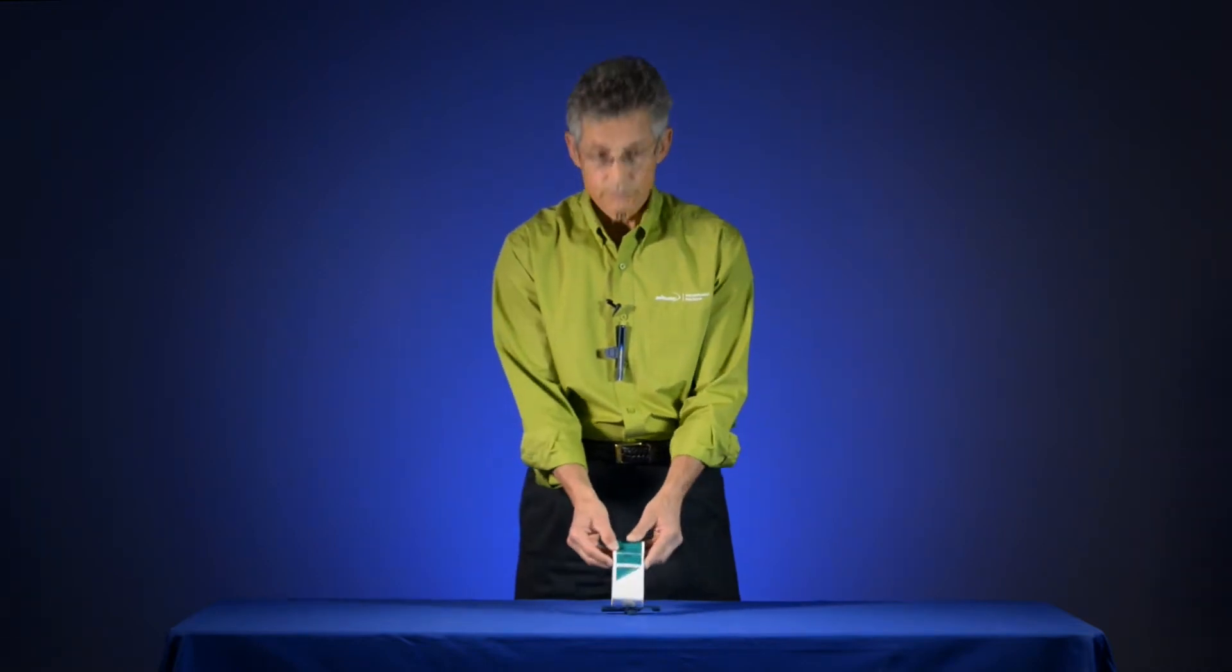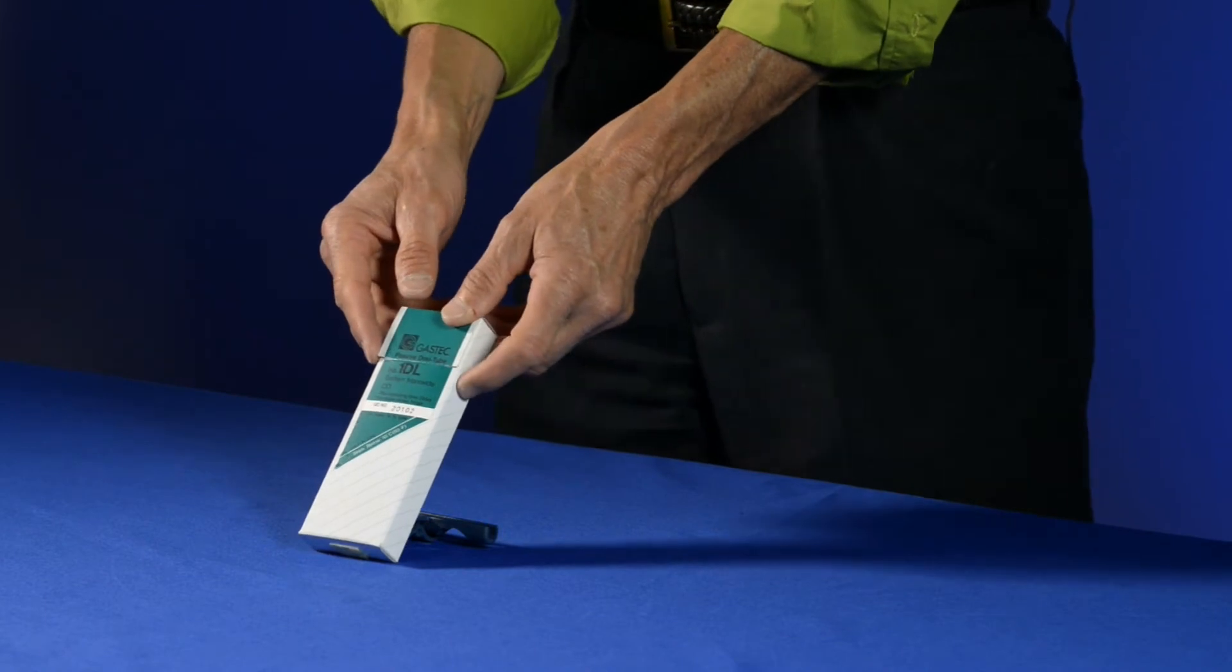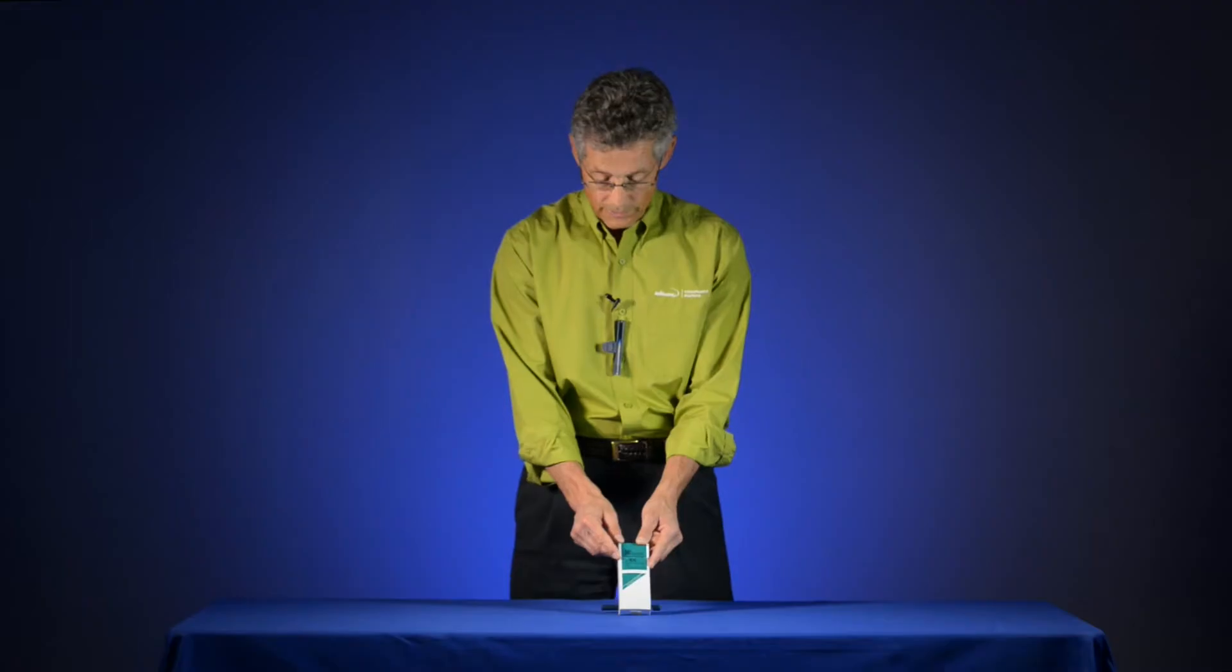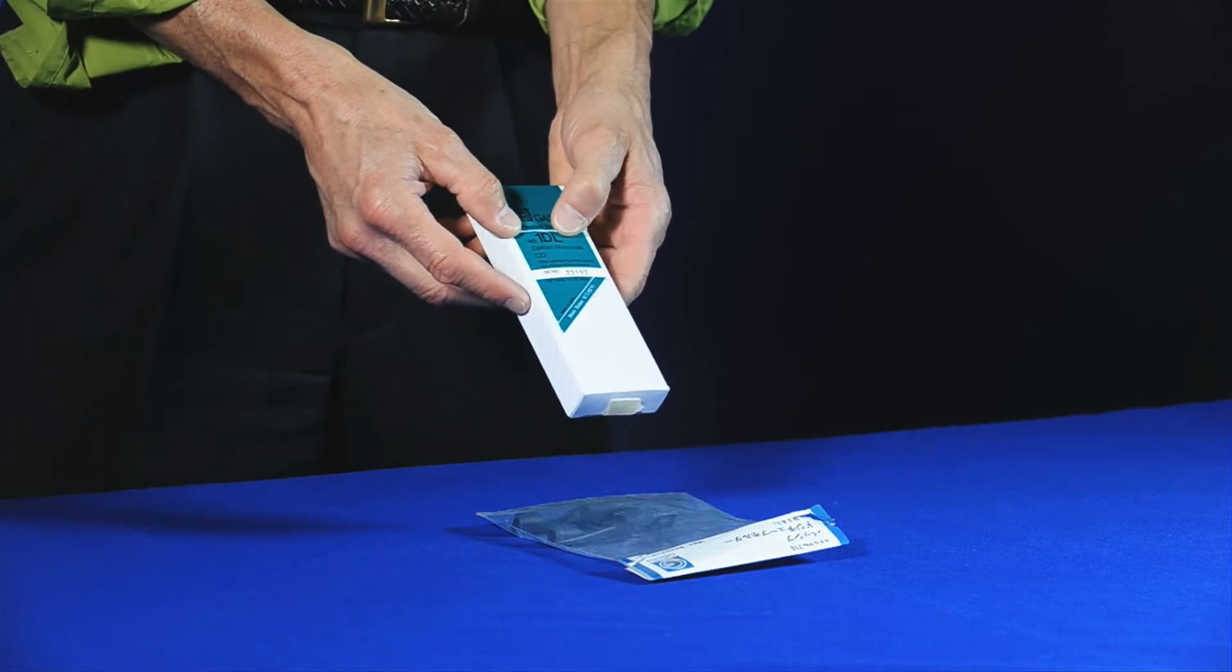So there are lots of DOSI tubes available for ammonia, chlorine, NO2, SO2. In fact, there's 24 different tubes. One we're going to use today is the carbon monoxide or the 1DL tube.